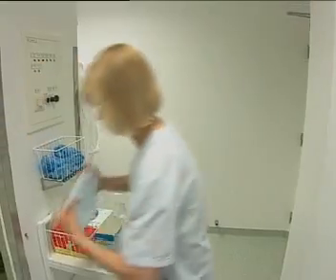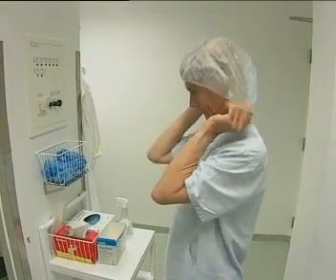Protective clothing is an essential component of individual preparation before compounding a parenteral nutrition admixture.